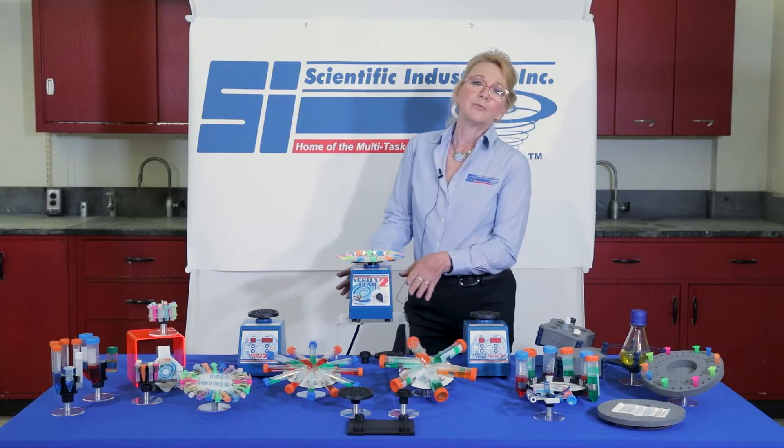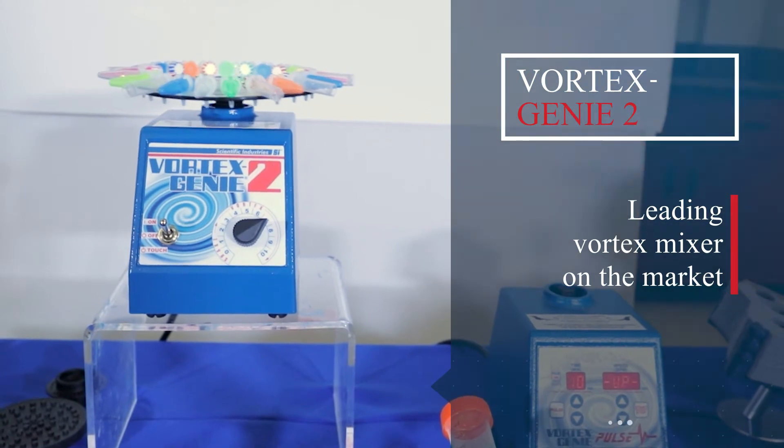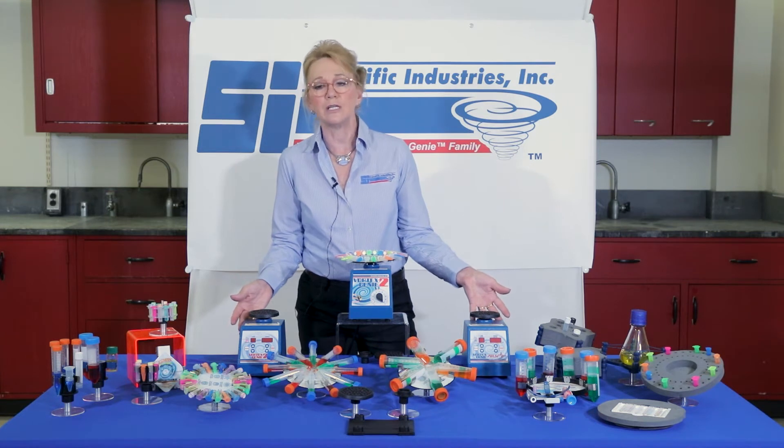You may already be familiar with the Vortex Genie. The Vortex Genie 2 is the leading vortex mixer on the market, but did you know that we have two other models in the Vortex Genies?